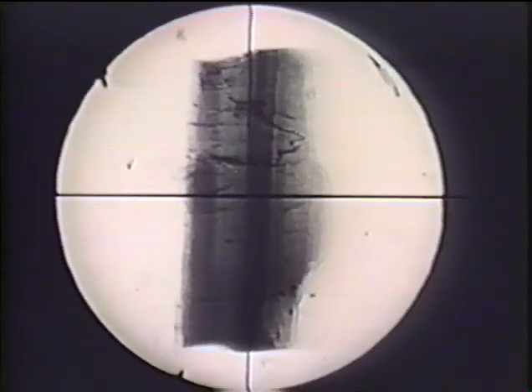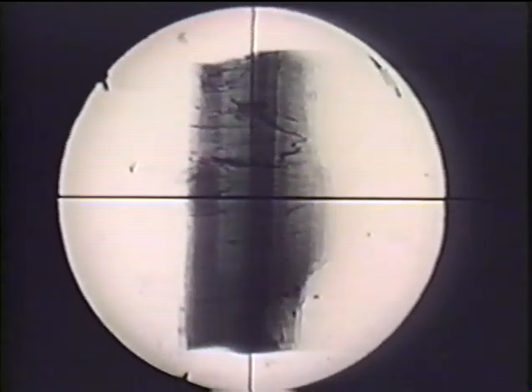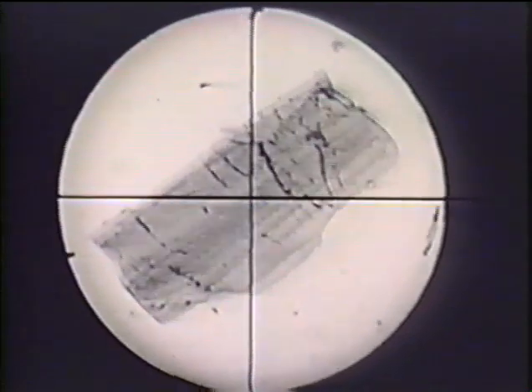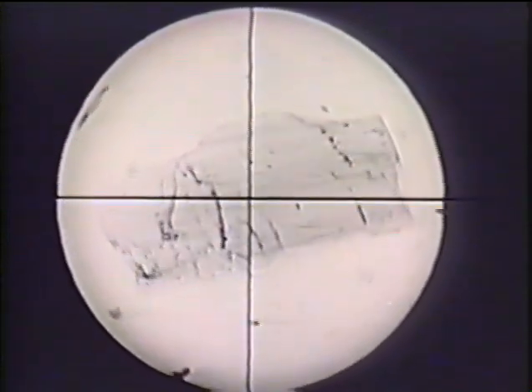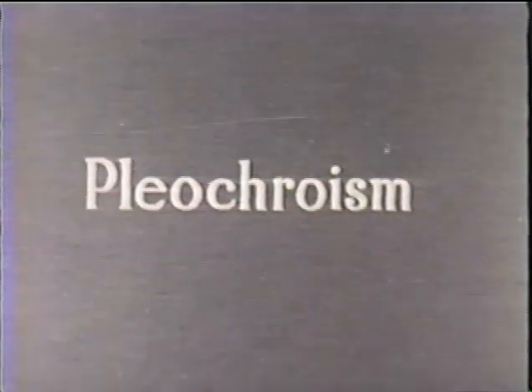Evidently the absorption of the light varies greatly according to the vibration direction. In white light the two vibration directions may give rise to quite different colors. This property is called pleochroism.